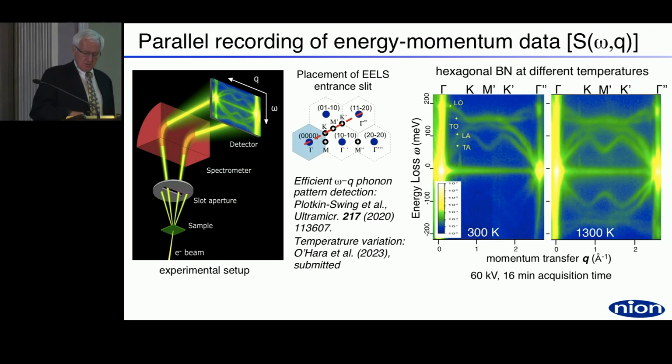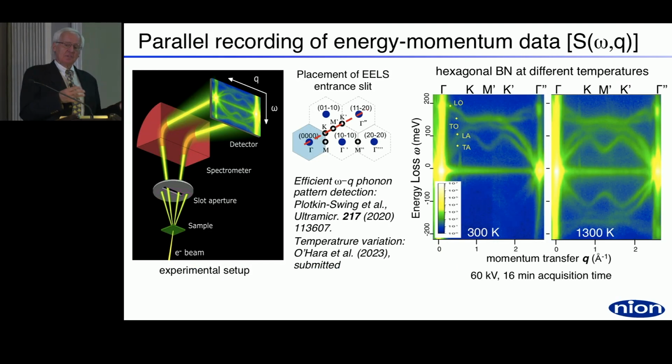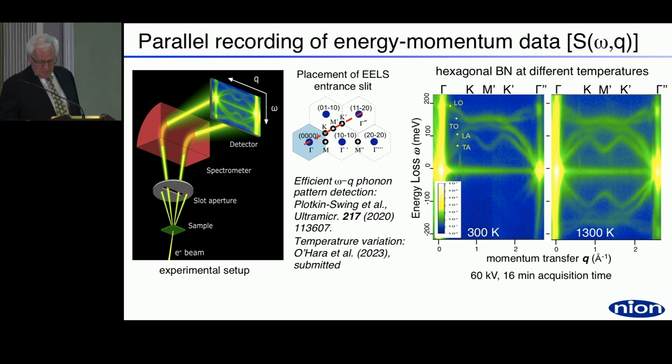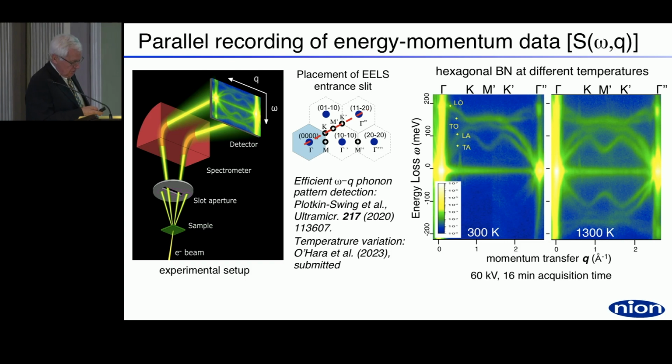Okay, now back to material science. So we're giving up this idea that we can decrease the spatial resolution and avoid radiation damage. With material science samples, they're much more sturdy. So you can do things like send an electron beam through the material and look at the diffraction pattern and select a particular line in the diffraction pattern, form a two-dimensional pattern in which you'll be looking at different momentum exchanges.